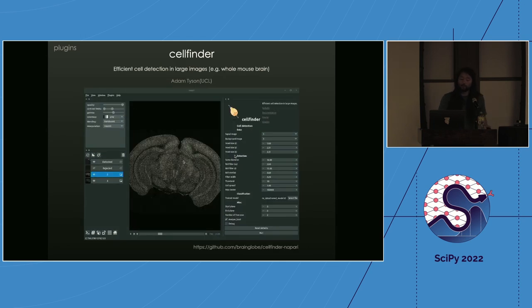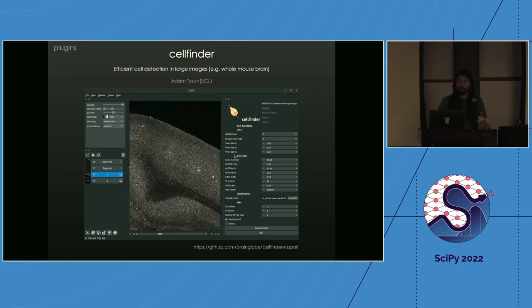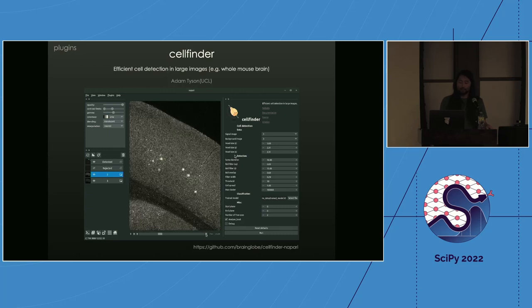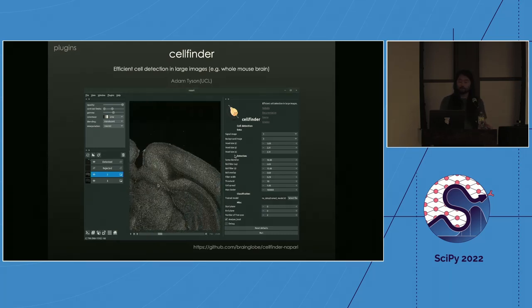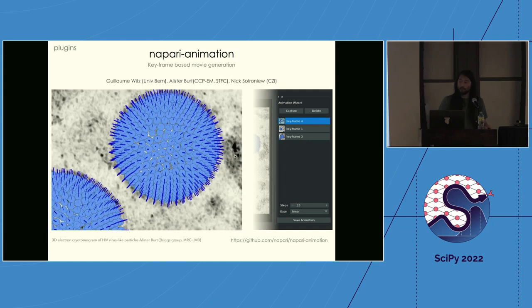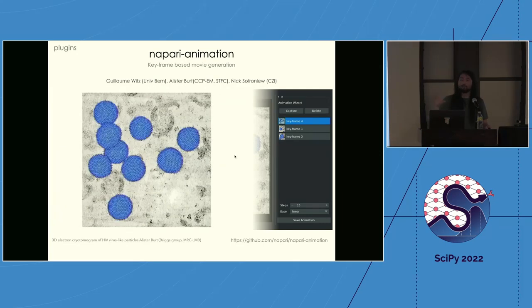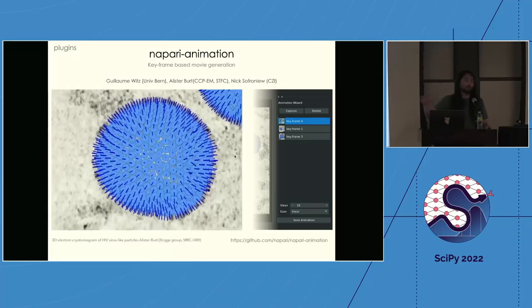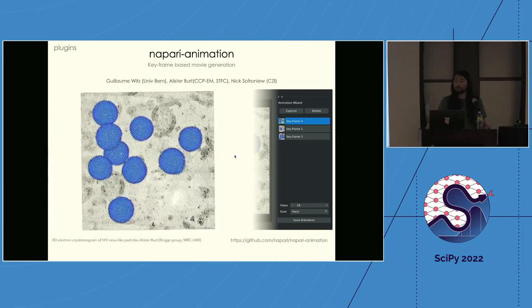CellFinder is another segmentation algorithm example, really focused on large images — Adam Tyson developed it to take images of whole mouse brains and find all the individual neurons of interest. Napari Animation, from Guillaume Witz, Alistair Burt, and Nick Sofroniew, lets you create animations from your images by defining keyframes, automatically creating a video that interpolates between different locations — great for sharing results with collaborators or generating movies for publications.